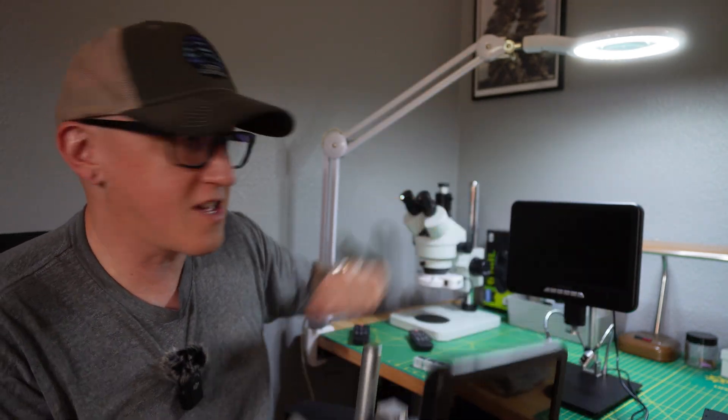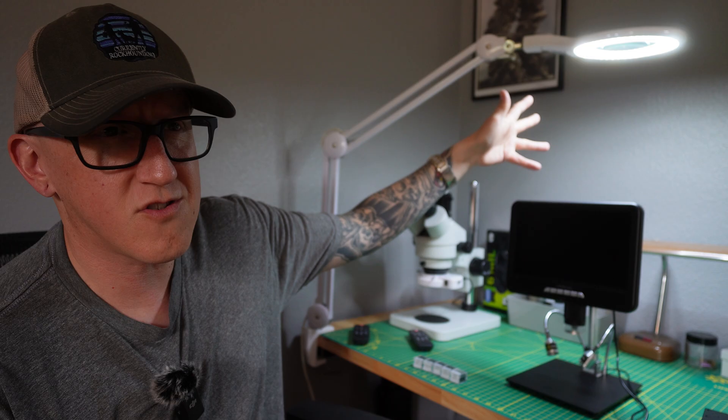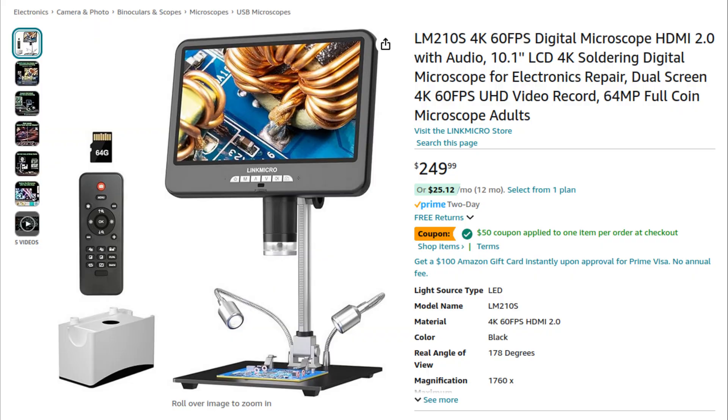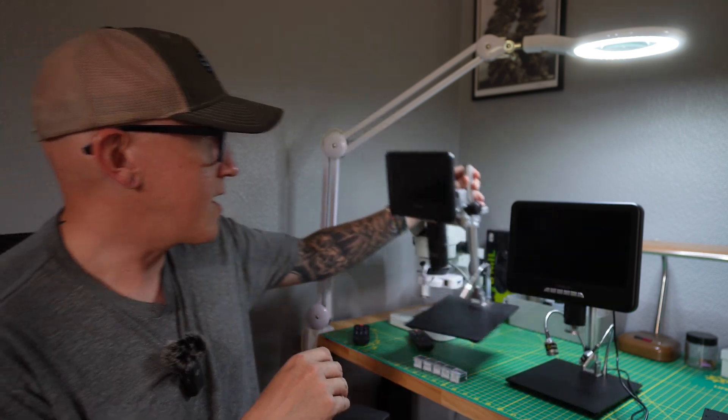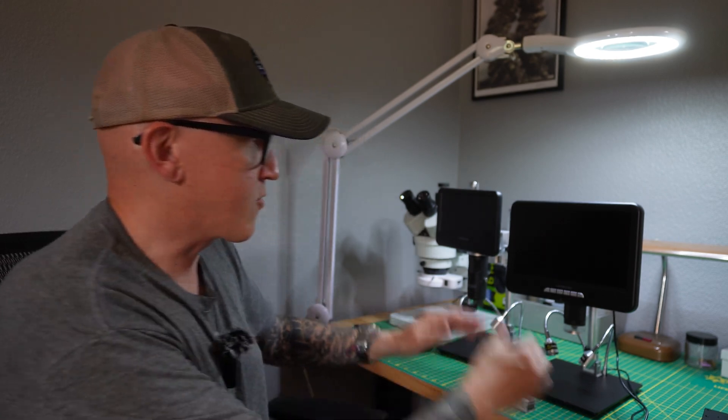So that's what we are going to be doing today. We're going to be looking at these things. This one is about $250, and there's a $50 coupon on Amazon — I'll throw links down below. We're going to be looking at five specimens: some Azurite, Analcime, Clinoptilolite, Gyrolite, and some Thompsonite. We're going to be doing some comparisons, so let's hop right into that.